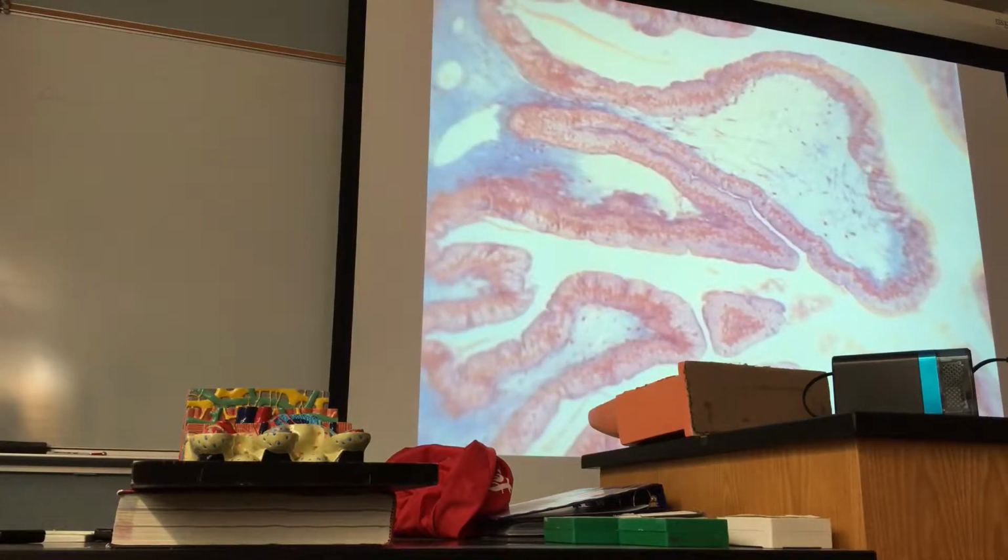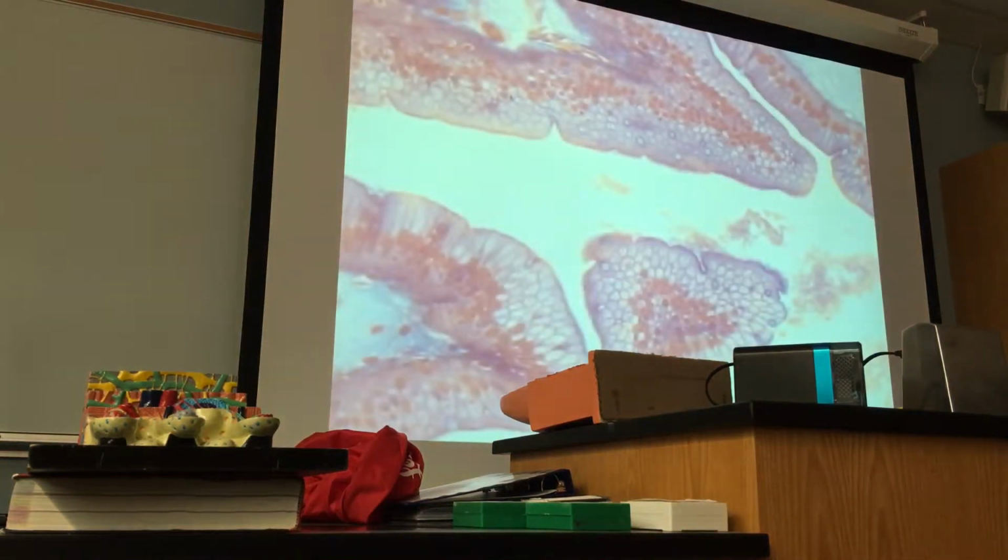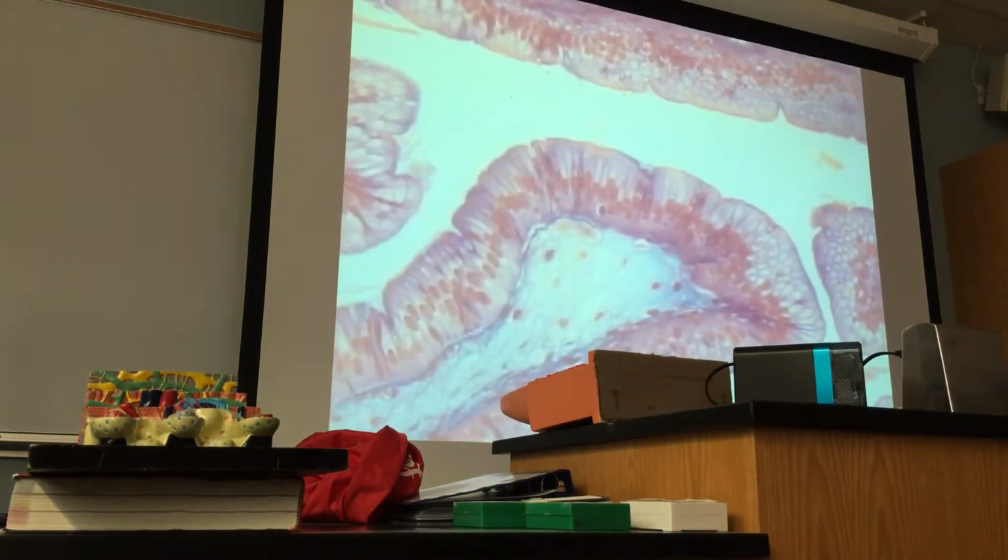You might have seen in P1 a very good example of simple columnar epithelium. Look at that. Beautiful, isn't it? Here we go.